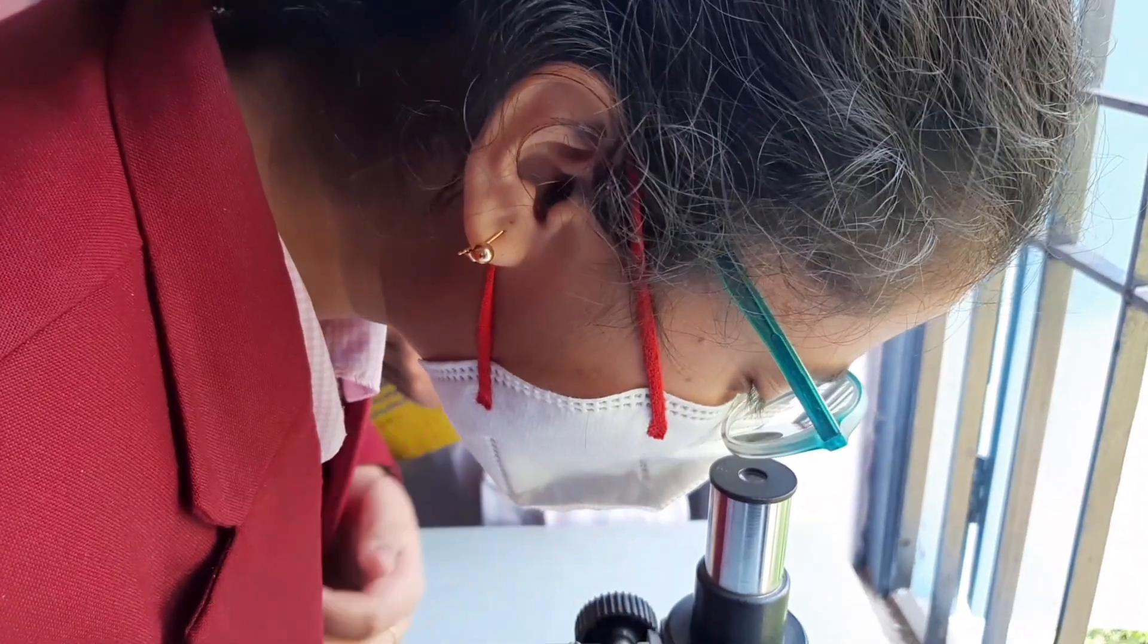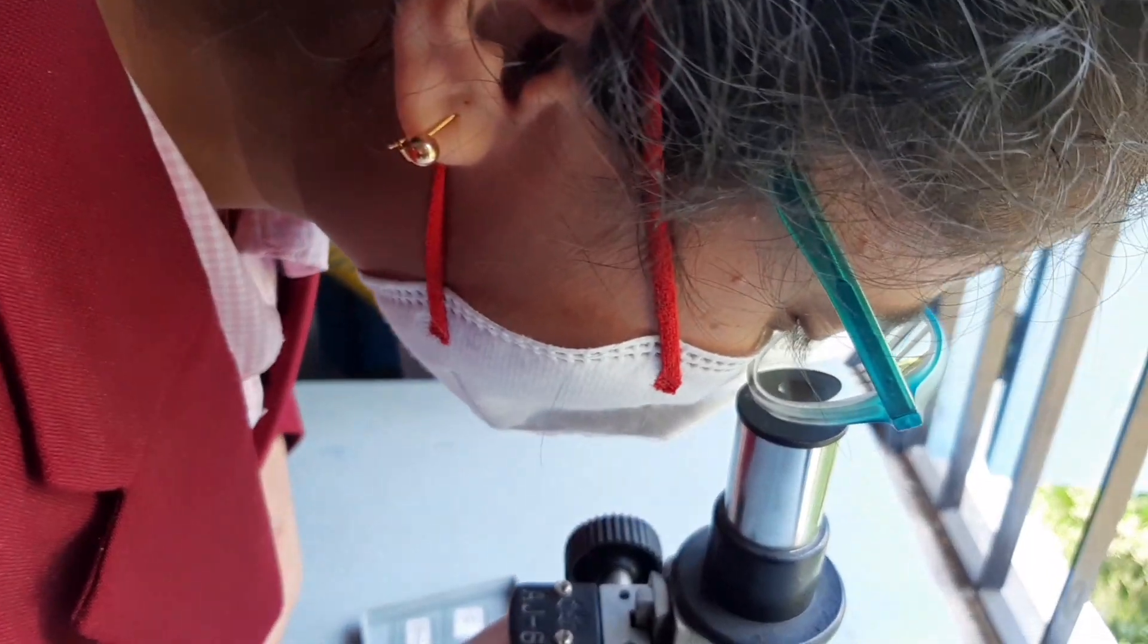The next type of tissue we are going to study is sclerenchyma. Now we have to fix the slide on the stage of the microscope and view it. We can see the sclerenchyma tissue. Let me adjust and show you.